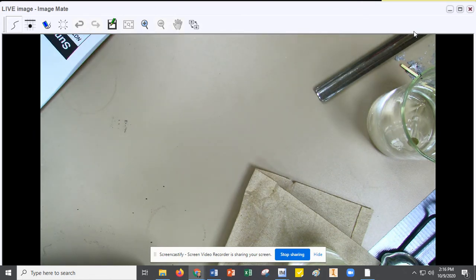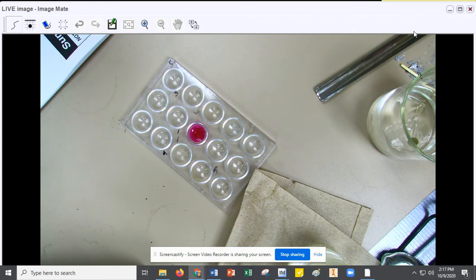All right, and so next up we have station 7. Don't forget to answer, is that a physical change, is that a chemical change, and explain your reasoning. Up next for station 7, you don't have to worry about cross-contamination because you are not actually performing this, but cross-contamination is a very big issue when it comes to performing laboratory experiments. And so I'm going to grab 2 clean pipettes.